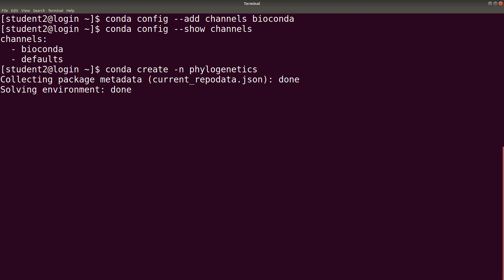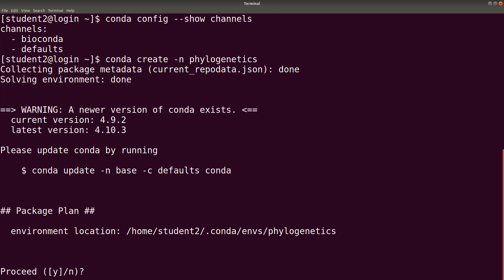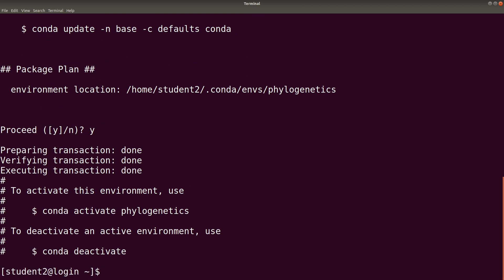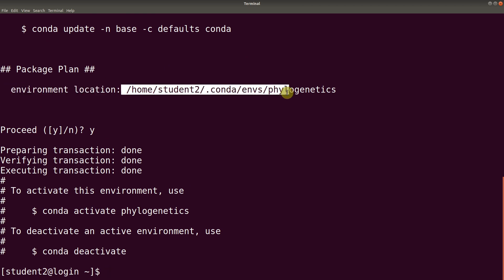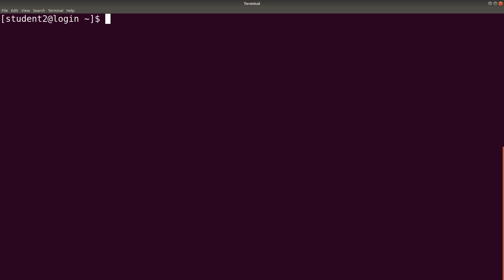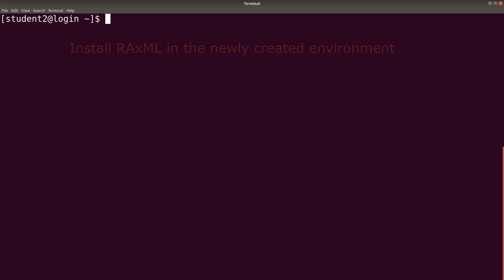We will then confirm by typing Y. The environment will then be created for us. It also gives the location where we can find it. Let's clear the screen first. We are then going to install RAxML in the existing environment. That is the environment we've just created. And this is how we do it.